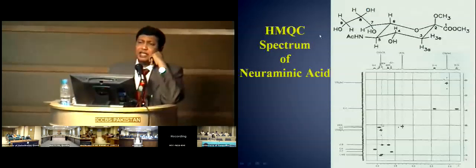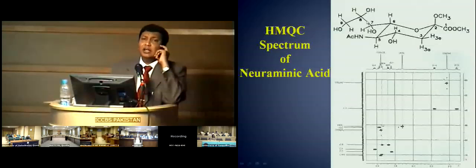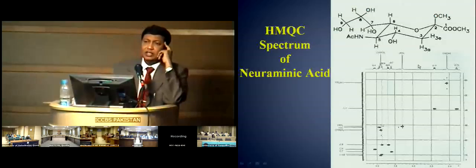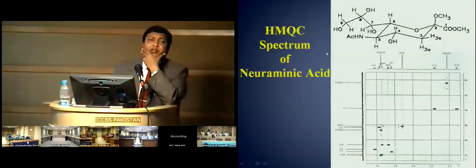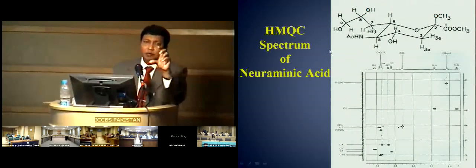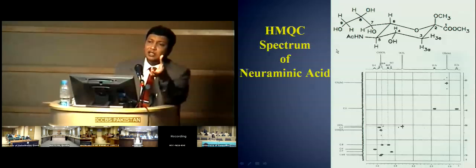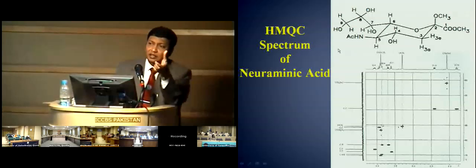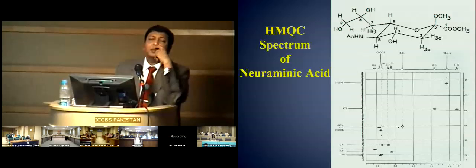Well, the sequence. Multiple quantum and single quantum we will learn when we go to NMR spectroscopy. Kindly remember that a quantum is nothing but a flip of a particular nucleus. So a single quantum primarily means that alpha becomes beta. When you talk about multiple quantum, that means alpha alpha becomes beta beta, right? So you use a different pulse sequence and you get a different spectrum.